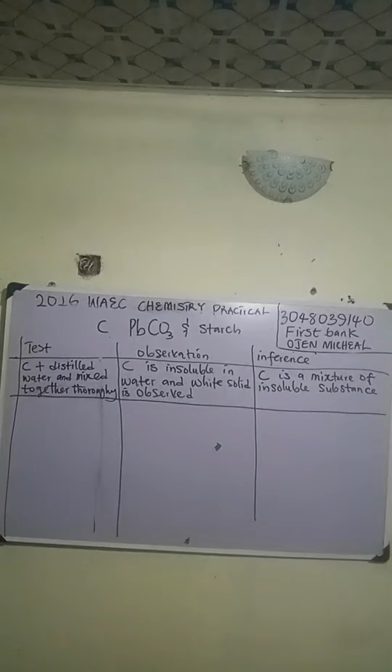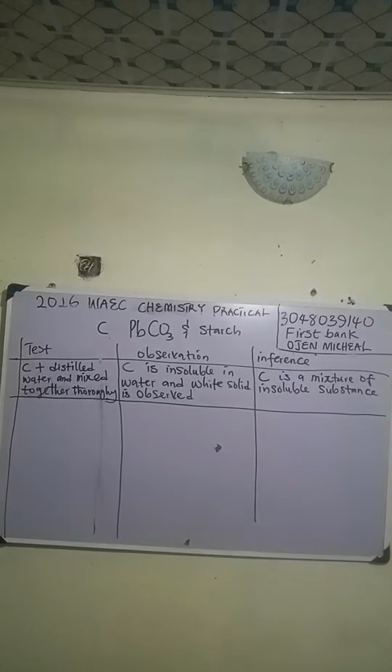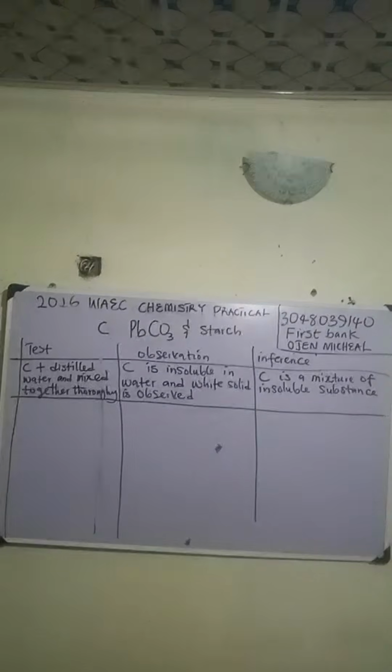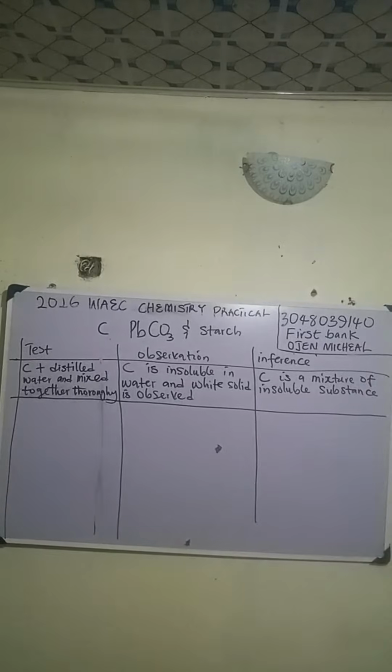No, it will not form a colloid. Okay, that is insoluble. A substance that does not dissolve in water is not called a solution. No, there is no specific volume. They will just ask you to dissolve it. Yes, that is how you will likely see it. I say this one is easier for you to predict. Yes, it will be given for you to fit the observation and inference.